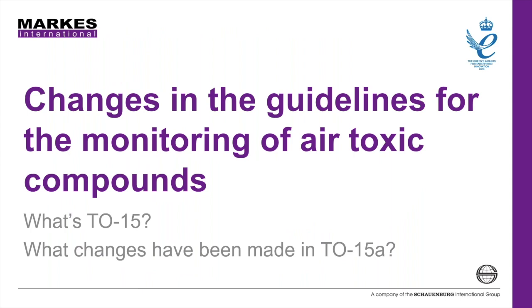Okay, now I can't begin a talk on air quality measurements without spending at least a little time on the TO15 update. Now, for those of you who are listening today that aren't monitoring air toxic compounds, I'm going to briefly review what TO15 is before we begin to look at the update and what changes have been made in TO15A.